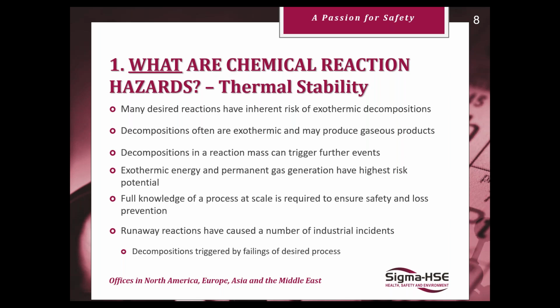So now getting into the bulk of our webinar today: what are chemical reaction hazards, specifically thermal stability issues. Many of our desired chemical reactions will have inherent risk of exothermic decompositions. It's just a matter of fact that some of our reagents may be thermally unstable. Obviously, we always try and design out hazards, but sometimes these are unavoidable.